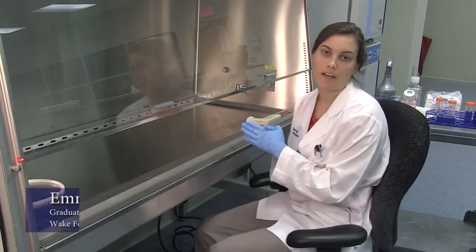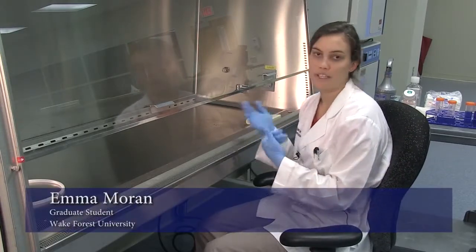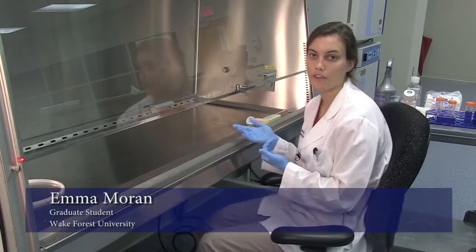Today I'm going to be talking about aseptic technique, which is used to maintain sterility when you're working with things such as cell culture to prevent contamination of your samples.